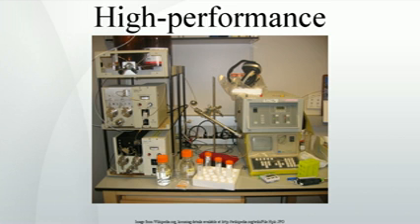The chosen composition of the mobile phase, also called eluent, depends on the intensity of interactions between various sample components, analytes, and the stationary phase, for example hydrophobic interactions in reversed phase HPLC. Depending on their affinity for the stationary and mobile phases, analytes partition between the two during the separation process taking place in the column.